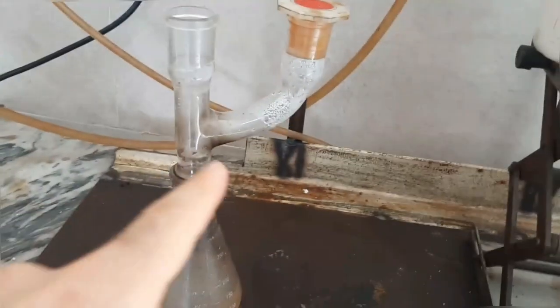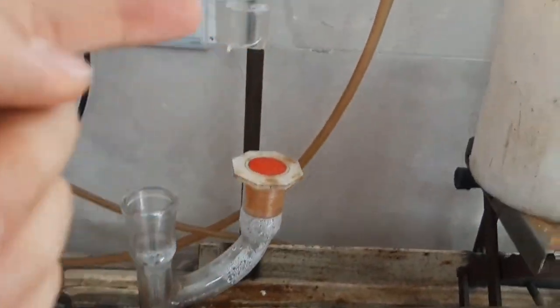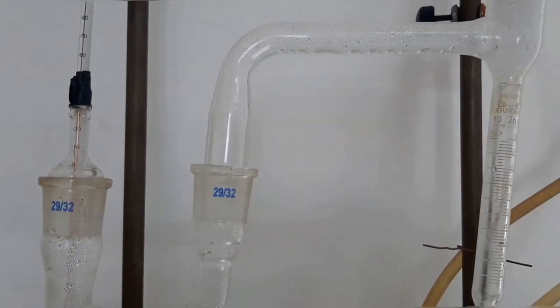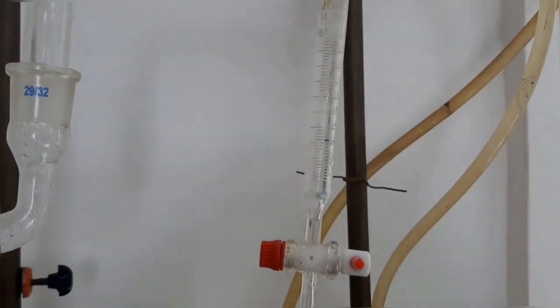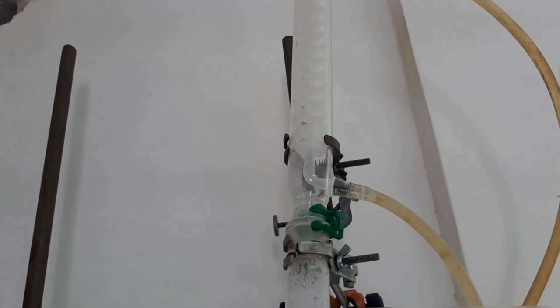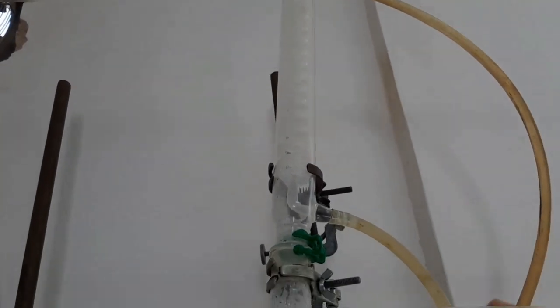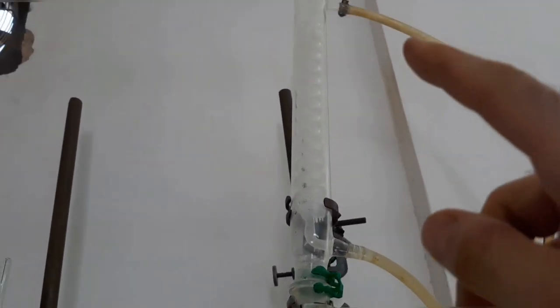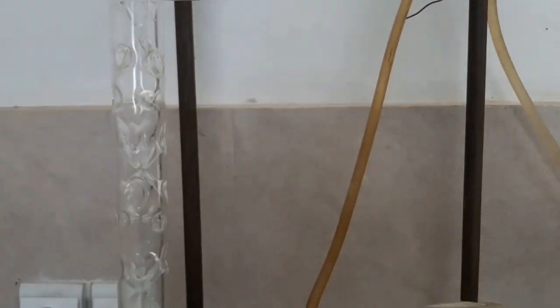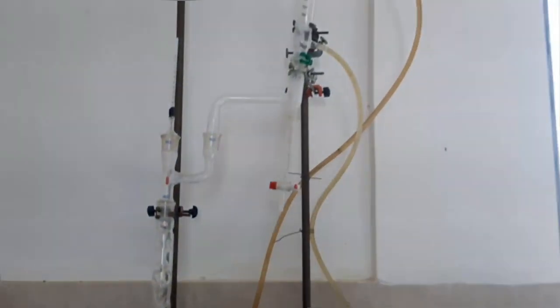You can see here the Claisen adapter, the Vigreux or distillation column, another Claisen adapter, a thermometer to give us the temperature of the overhead product, a Dean-Stark apparatus with a valve, and a reflux condenser with cooling water pumping through it. So this is the overall setup.